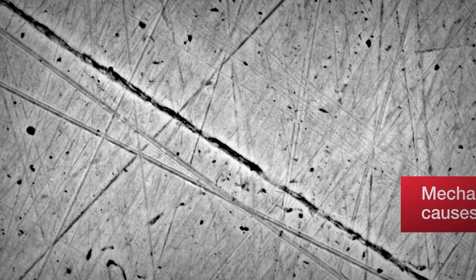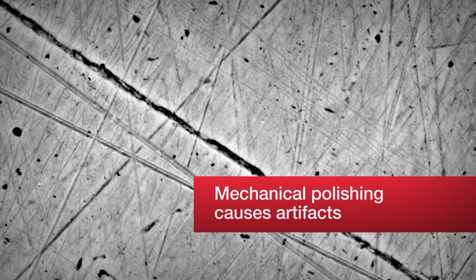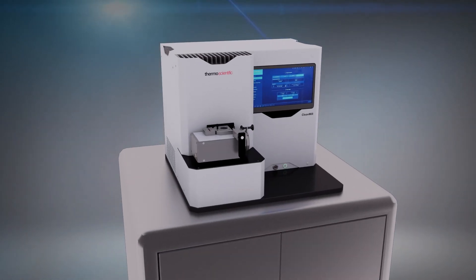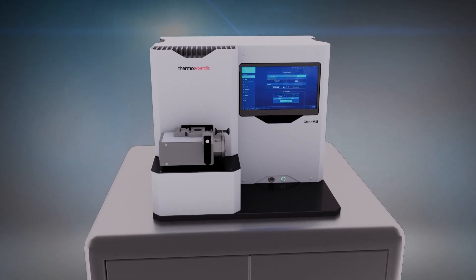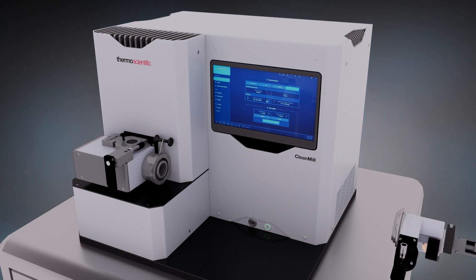In addition, samples that are mechanically polished often have artifacts that can obscure target features. That's why we developed the ThermoScientific Clean Mill broad ion beam system, delivering high quality material cross section and material polishing in a safe environment.